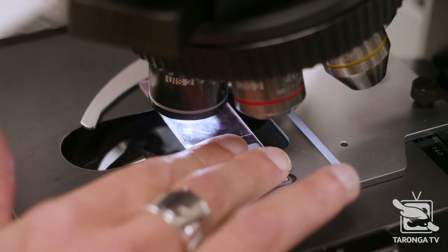Yes, we do. You've told me there's an incredible number of samples in the freezer. Yes, we're very fortunate. We've got samples representing wildlife health and disease going back to the 1960s and even earlier. That really helps us, because if we're faced with something like Tasmanian devil facial tumor disease a while back, our role was going through the registry and saying that is totally new. We've never seen any kind of tumor like that. We can say that because we have all of these samples from wildlife all across Australia.